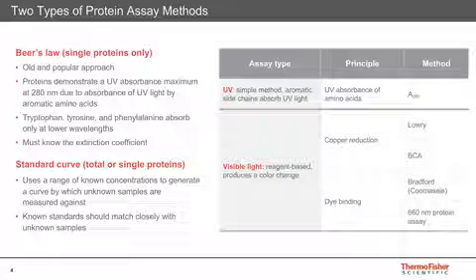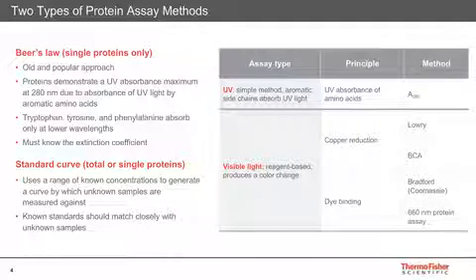Traditional assays contain limitations with respect to these parameters, but recent innovative developments provide near ideal solutions for protein concentration determination.